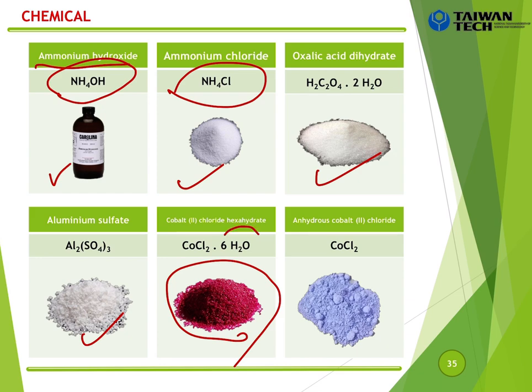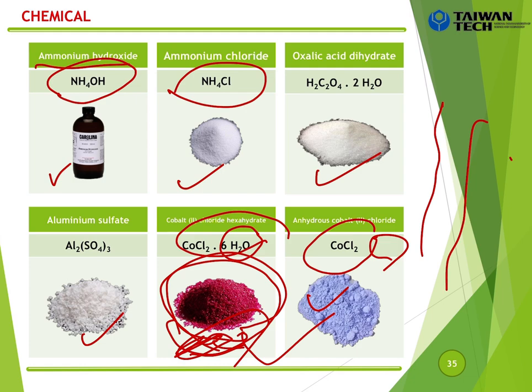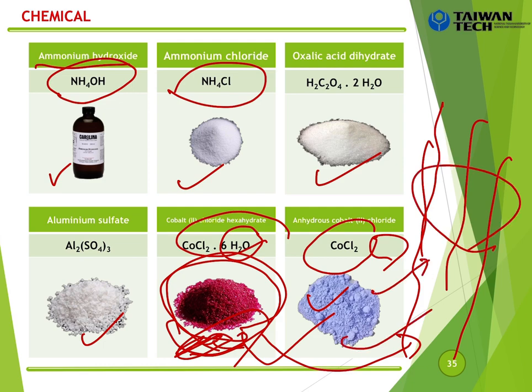And you can see the difference here with water and without water, and we have the different color. So when you dissolve this in water, you get the same solution with this color. But when you use this solution and you draw something, maybe like this, at the beginning I have this color. But when I let it dry, water can be removed, and when water is removed, I can get the blue color or some color like this.